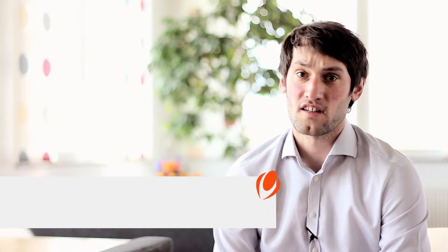Hi, I'm Tim Jones, I'm an account manager at Biotage, and today we're going to talk about just how easy it is to program a synthesis on the Initiator Plus.